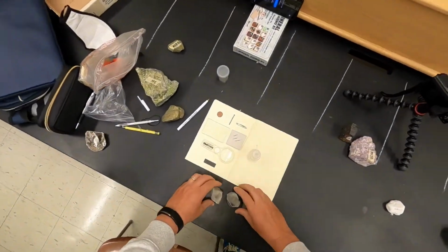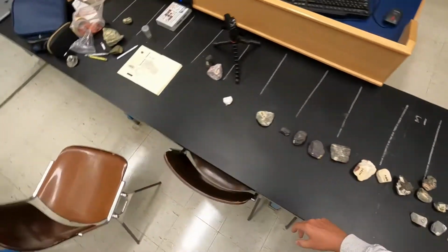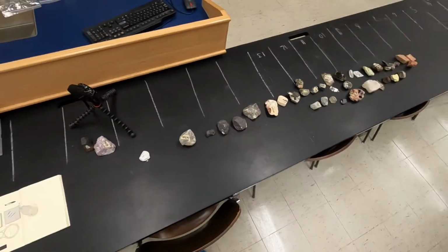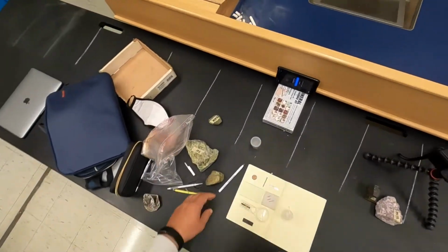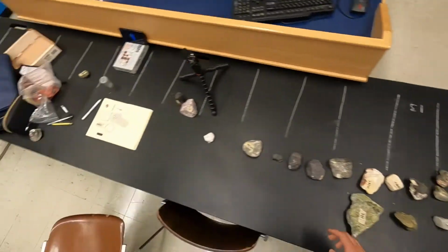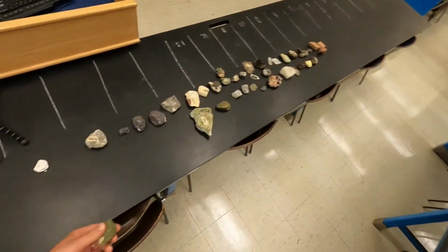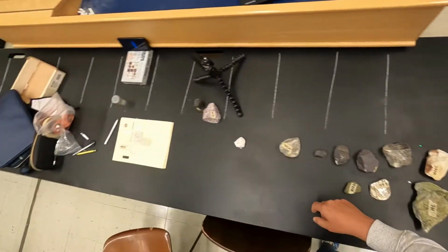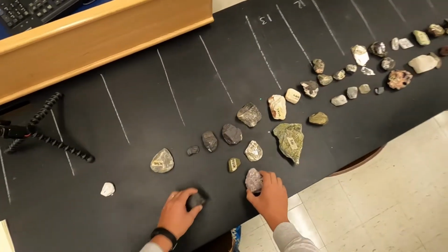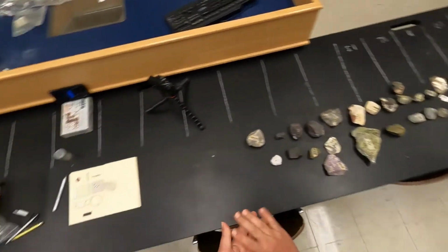This is a challenging job, so we are going to try to adopt an approach that is like a divide and conquer approach, which is what I recommend quite often when dealing with large amounts of specimens. So I've got pretty much all my minerals in here.